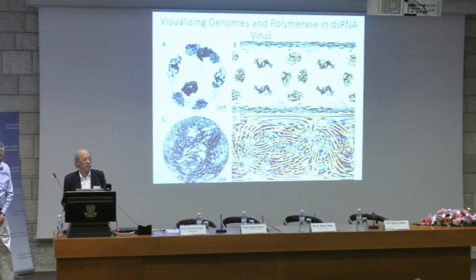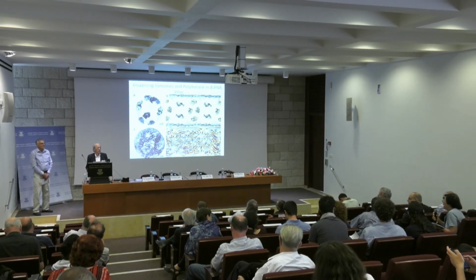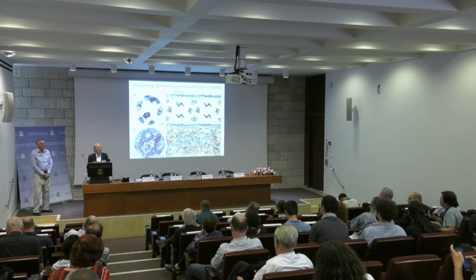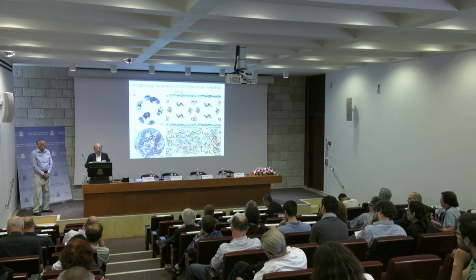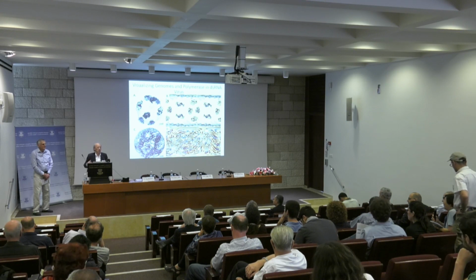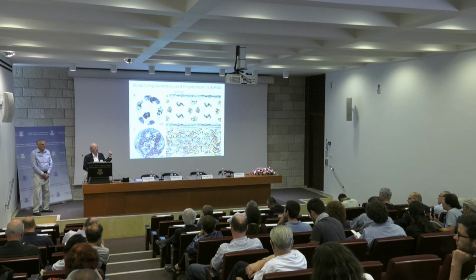In your GroEL, GroES assembly, could you watch the reaction when the GroEL comes onto the GroES and the protein? I would love to see that. I would love to see it in the cell. I haven't got that yet. But the next action is looking at the bacteria, and particularly some systems that overexpress the GroEL and GroES to see that process. Because there's still a lot of controversy whether the GroEL and GroES form American football or bullet-shaped particles. Those still remain controversial. So the solution is actually cryo-EM tomography.